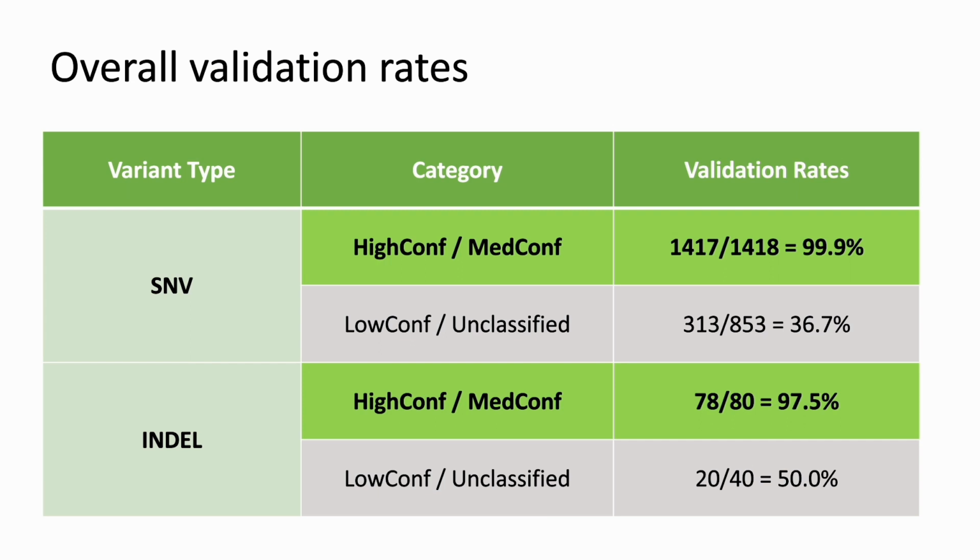That variant call had very strong evidence and many variant reads in almost all of the whole genome sequencing datasets, but no such read was found in the validation data. We believe it was more likely a false negative in the validation platform, rather than a false positive in the reference call set. When there was contradicting evidence between 21 sequencing replicates in whole genome sequencing versus one single validation dataset, we had very little reason to overturn it based on that single validation dataset.